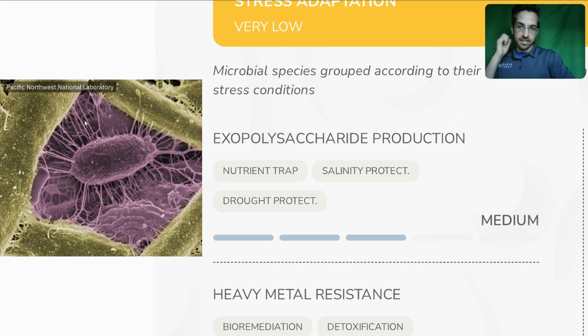You can see in this image, when you take images like this, you have to completely desiccate and dry down the sample. So the exopolysaccharides have been desiccated. They're completely dry. They've turned stringy. But these stringy bits, that's exopolysaccharides, extracellular polymeric substances. These retain water. They retain nutrients. These are the glues that build water-stable microaggregates. This is the foundation of soil structure.